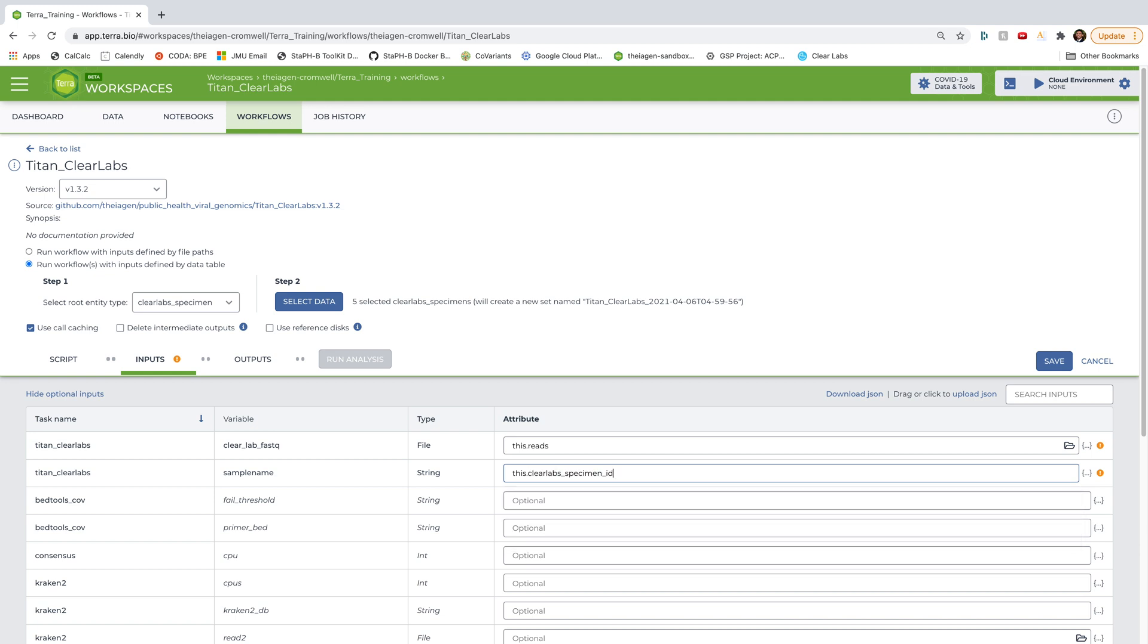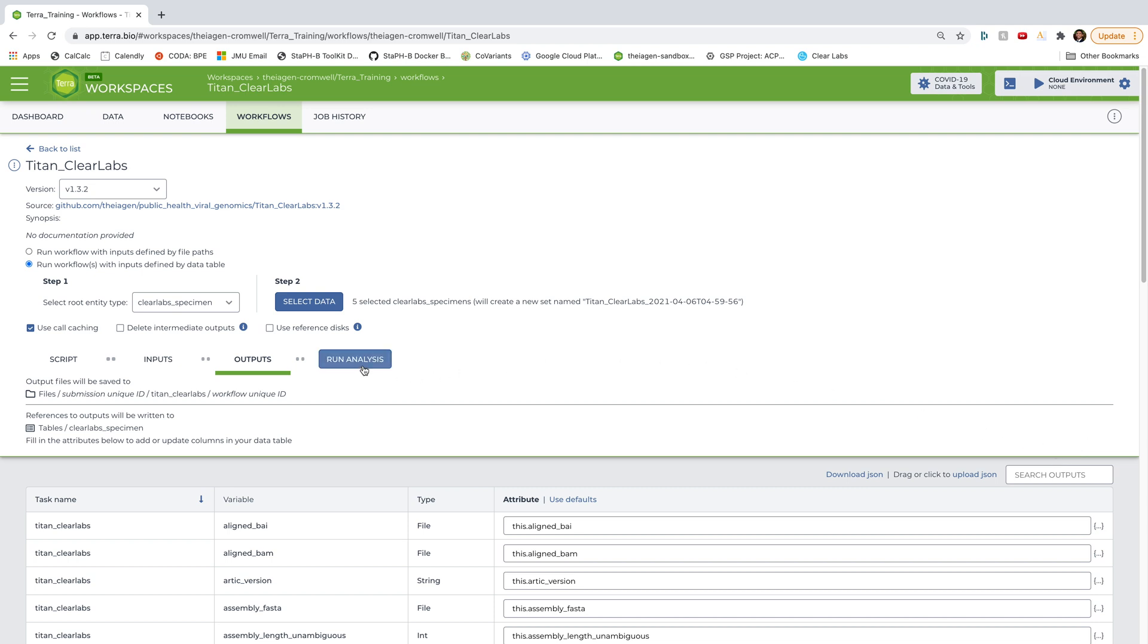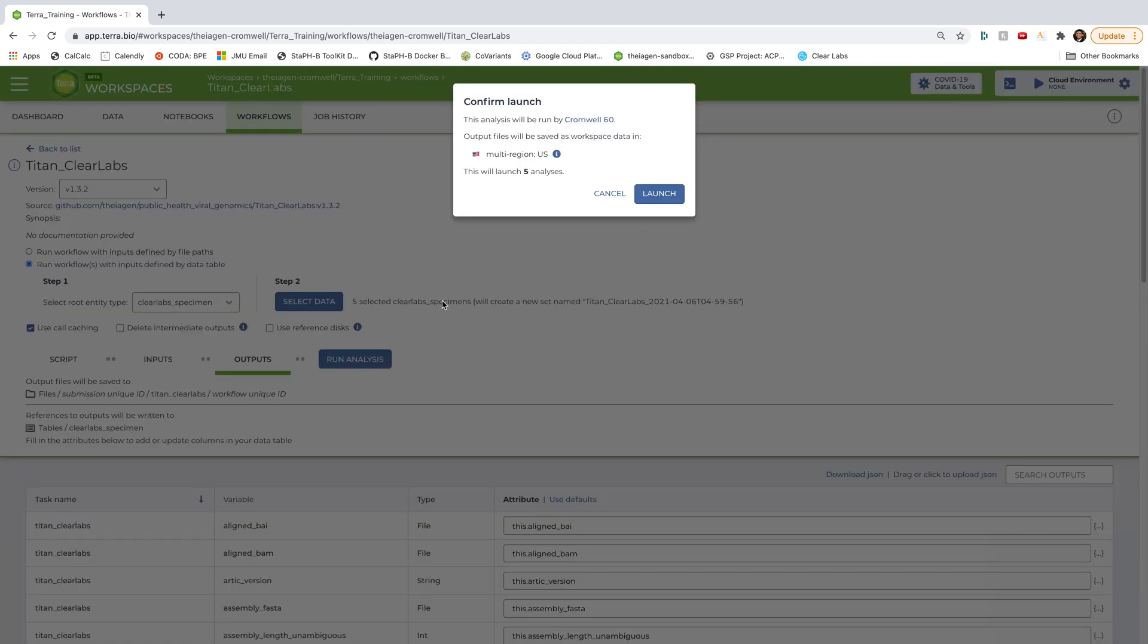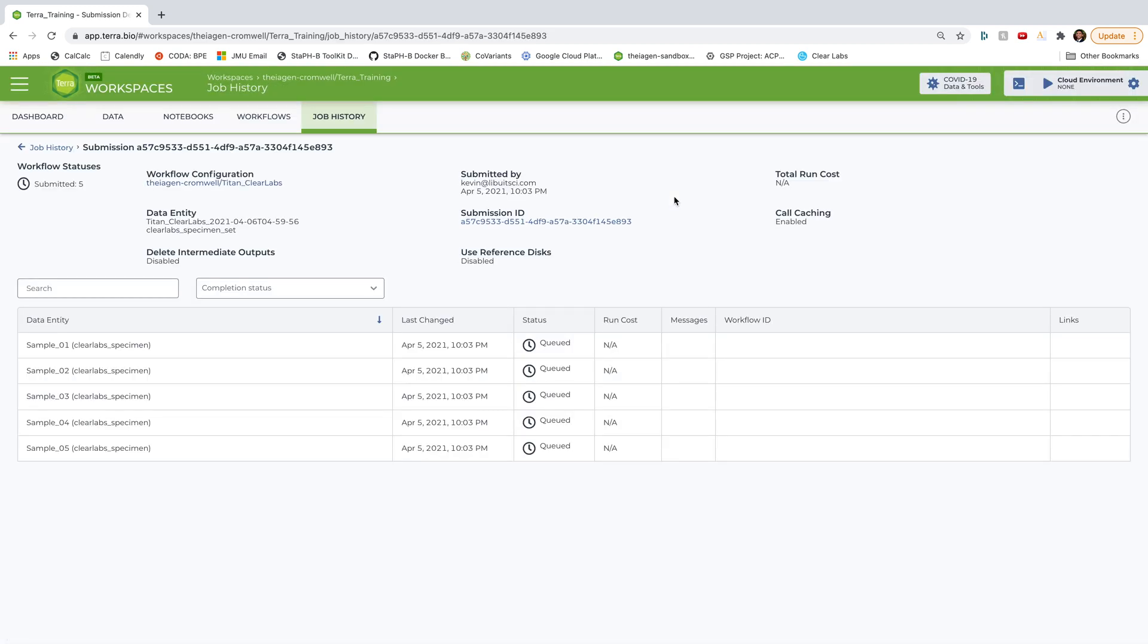All right. And so with that, I'm going to go ahead and move on to outputs. And for this and pretty much every workflow, I'm going to just select use defaults and allow it to populate the default outputs. And then from here, I'm going to hit save. And then hit run analysis. And then I'm going to go ahead and hit launch.